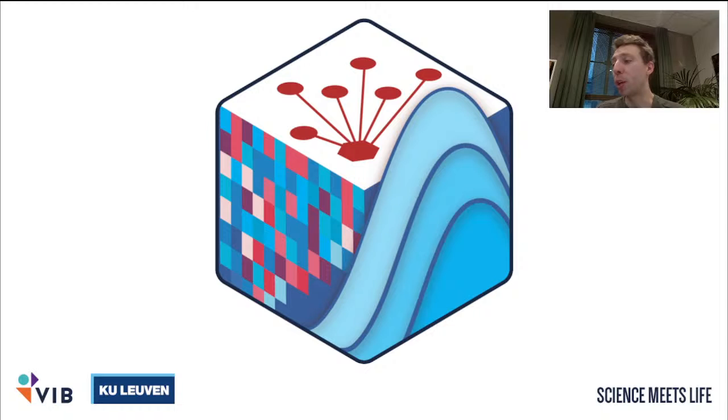Whether you can use pre-existing analysis from Signac and chromVAR with SCENIC+. Yeah, in theory this is possible, but of course we don't really have tutorials for this. We cannot cover all of the tools that are available. It will be quite hard, of course. You have to fit to the data structure that SCENIC+ is using, but if you are able to do this, you in theory can, but we don't have any functions to specifically do this.